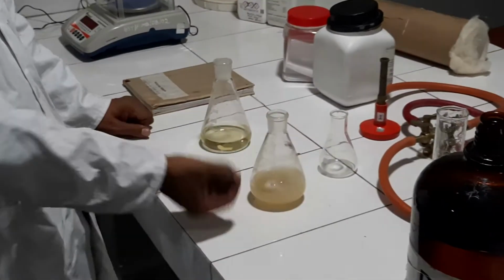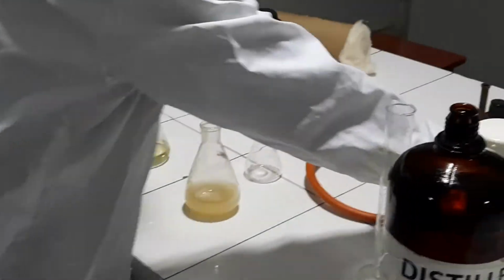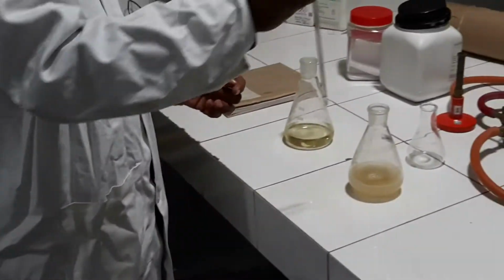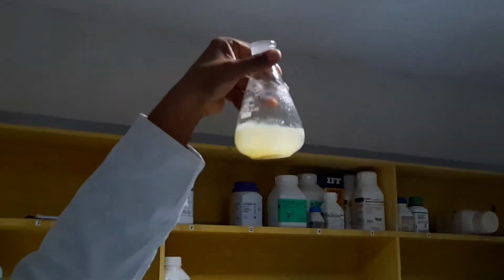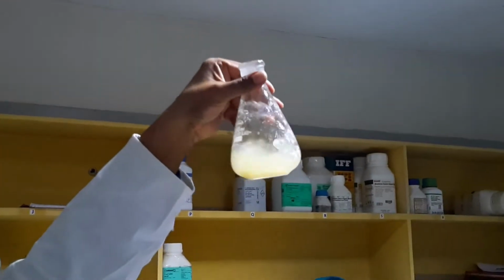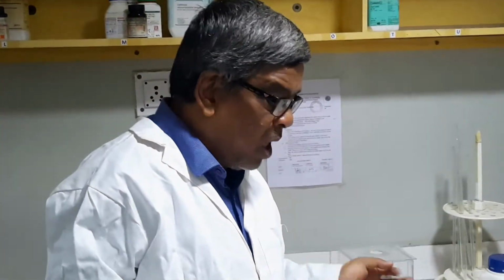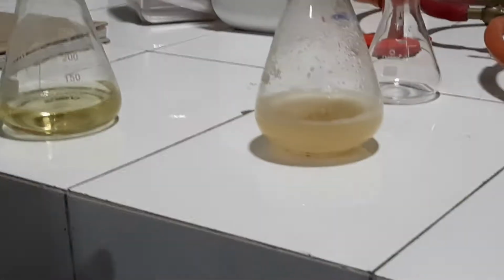proper. If any beads or particles are there which are not dissolving as a solution or suspension, you will have to use a glass rod, hold it and tap like this, but this is not the case here. It is completely clear. At the bottom it is suspension and at the top it is solution. And if anything remains, when it is autoclaved in the heat it will dissolve. Now see, I will make up the volume. It has not reached 100 ml. I am talking about liquid medium.